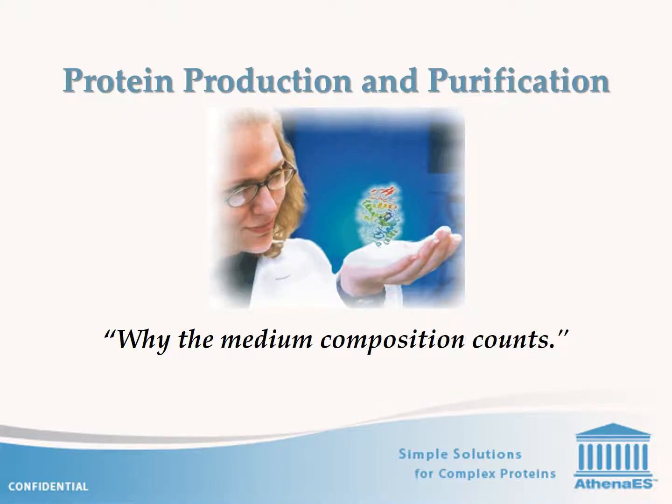Welcome to our mini-seminar series on improving the production and recovery of recombinant proteins. This lecture concerns why the medium composition used to produce a recombinant protein can mean the difference between success and failure. The focus of the talk will be on E. coli expression systems.